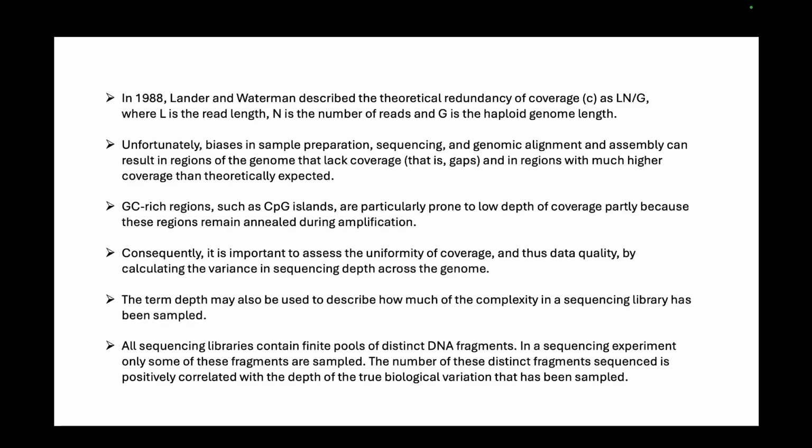So one explanation might be that the 500 base pair region has been duplicated in the genome that you're sequencing. It is a 500 base pair region in your reference genome, but it might be a 5000 base pair region in your own genome where 500, 500, 500 has been repeated 10 times. So the number of reads from those repeat parts will be higher, because the same read has been generated multiple times due to duplication of the genome.